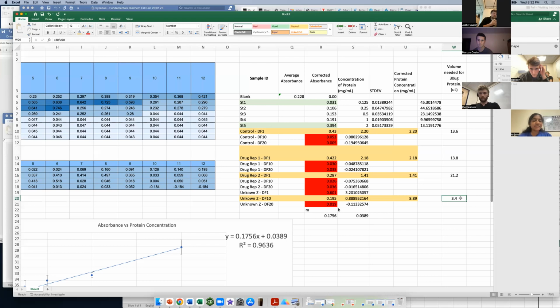I have one question. I'm in the Tuesday lab. Did you know what was wrong with the BCA, the blanks? Yeah, I think we have too much sucrose in our lysis buffer. So you can add sucrose to lysis buffer to basically place osmotic stress on the cells. So you have a high concentration of solute outside the cell, so water is going to flow out of the cell. Does that make sense?